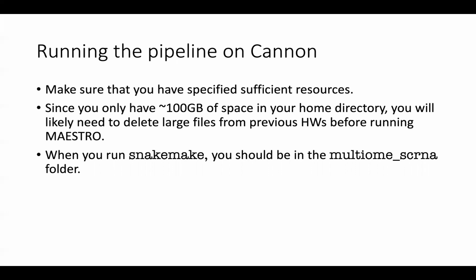And apparently your previous homeworks, which I didn't do, use up a large majority of that. So much to the point that if you haven't deleted some of your large files from previous homeworks, Maestro may not run. So do be mindful of that.